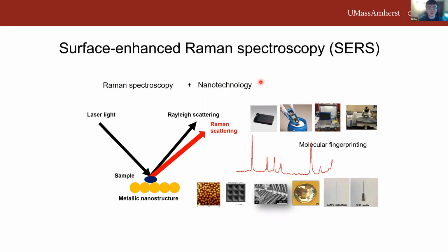And this is so-called surface enhanced Raman spectroscopy, or SERS. So the principle behind it is, when the sample is close to the nanoparticle, such as silver or gold, when the laser hits the sample, it will generate hotspots at the nanoparticle surface, and these hotspots will significantly enhance the Raman signal of the sample itself. So with this, we can improve the Raman signal of some chemicals that are weak and characterize their properties. I will show one example.